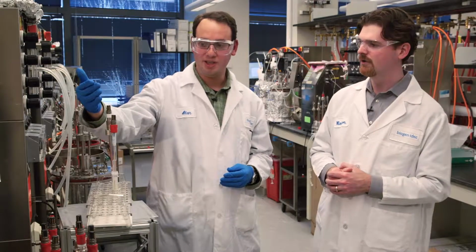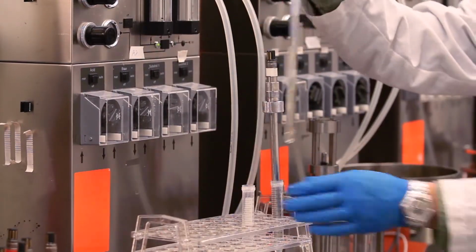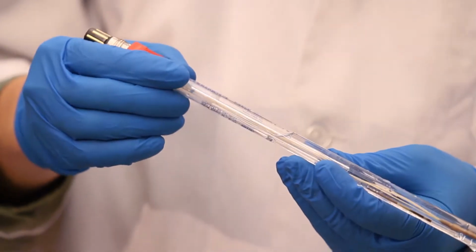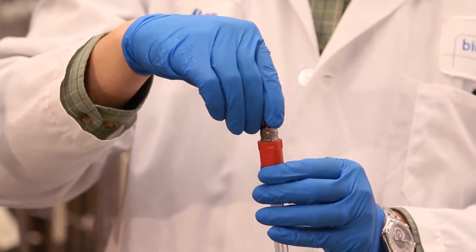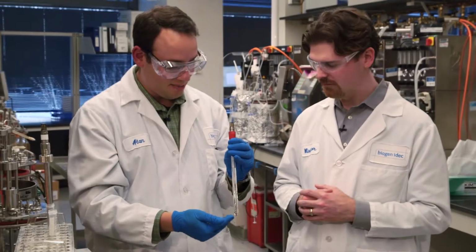So we typically use just a pH and a dissolved oxygen probe. The pH probe is just a very traditional pH probe here. Yeah, I can see the liquid and the electrodes inside. Yep, and you can see the position where the gel stops as well. So what you've got here is electrical connections on top, which goes into the control box, and that's how it connects its measurement from the bottom foot.